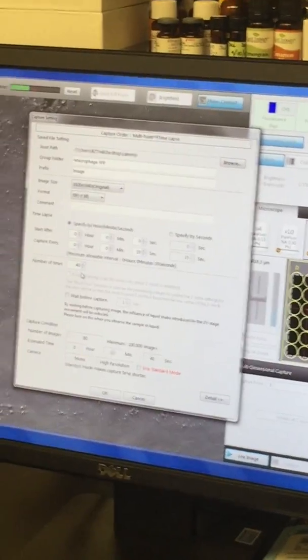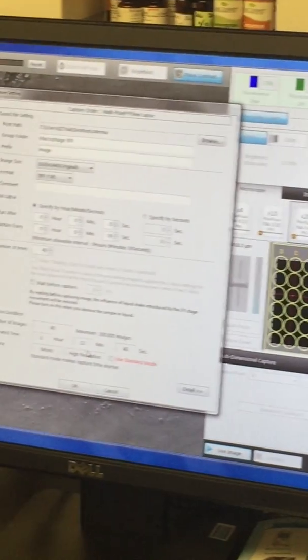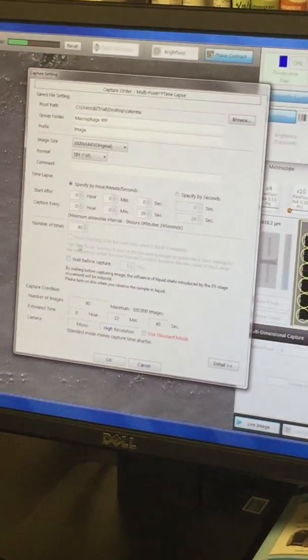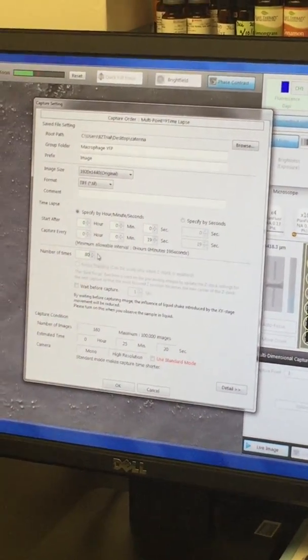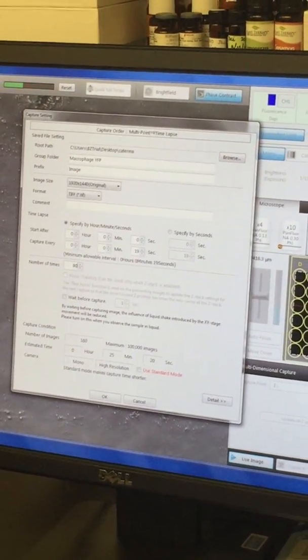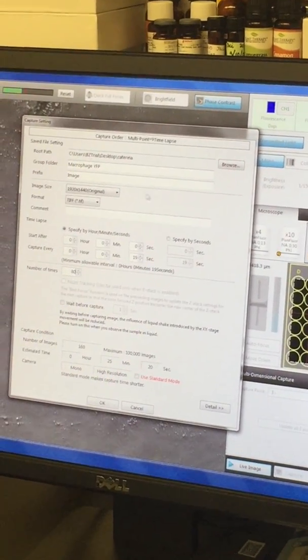This is the number of times you're actually going to want to run that experiment, and then here's the total amount of time overall. So let's say you want to do it just for 5 hours. Again, just make sure that you do this right here. Feel free to set this whole thing up, 25 minutes, but you want to get this up to 5 hours. Just keep going up with this number. It might have to be 500 times. Totally fine.